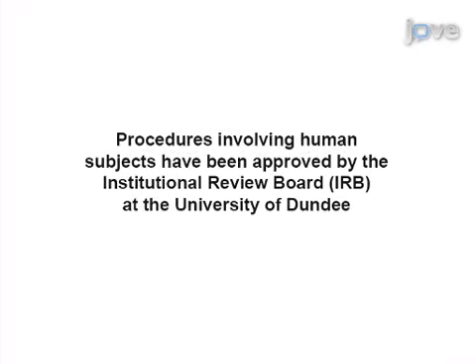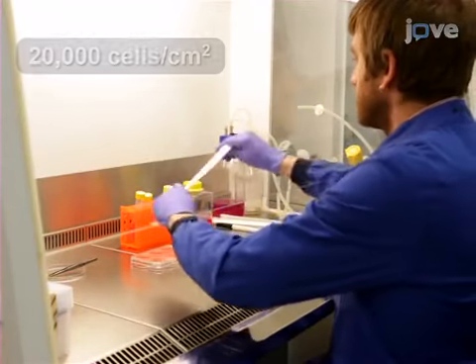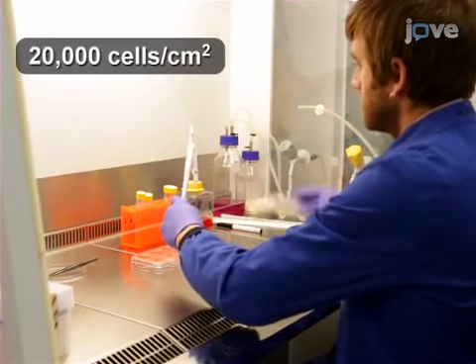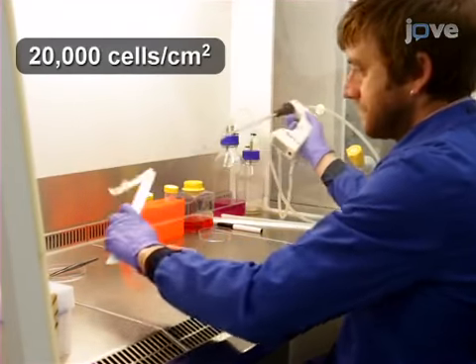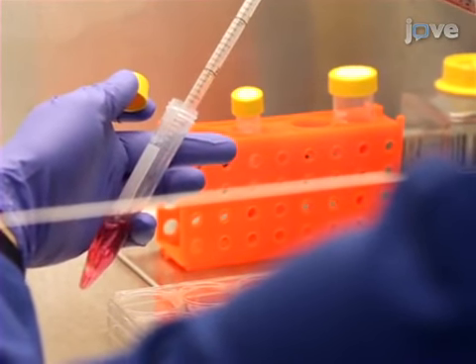The advantage of this technique for generating 3D organotypic cultures is that we can assess native matrix produced by fibroblasts themselves, in the absence of synthetic or foreign substrates such as cross-species type 1 collagen. Begin by seeding 200,000 fibroblasts per well in six-well plates in fibroblast media supplemented with freshly prepared L-ascorbic acid 2-phosphate.